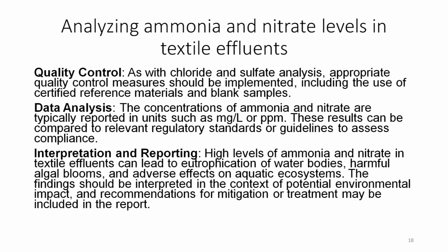Quality control. As with chloride and sulphate analysis, appropriate quality control measures should be implemented, including the use of certified reference materials and blank samples. Data analysis. The concentrations of ammonia and nitrate are typically reported in units such as milligram per liter or ppm. These results can be compared to relevant regulatory standards or guidelines to assess compliance.